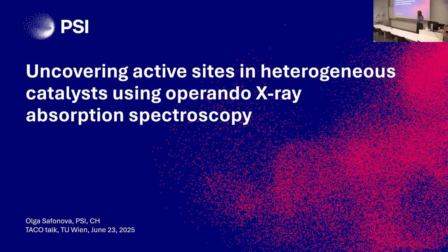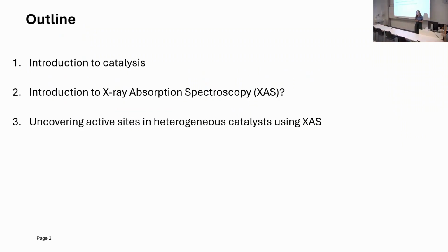And so the talk will be structured in the following way. First of all, I will introduce you, just remind you of the basic concepts of catalysis. Then we'll explain the basic principles of X-ray absorption spectroscopy, which is relevant for catalysis research. And the main part of my talk will be showing you research examples from my group in particular, where we used X-ray absorption spectroscopy to get much more information about the structure of active sites and reactivity.